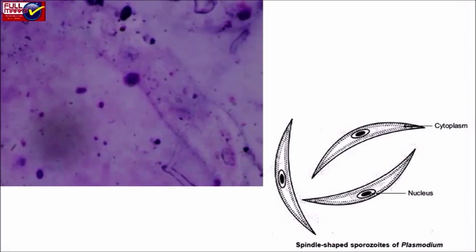Comments: It is a digenetic endoparasite of man. It completes its life cycle in two different hosts: in man as primary host and in female Anopheles mosquito. Its asexual cycle is completed in man while its sexual cycle is completed in female Anopheles. It causes malaria. Mode of infection: Bite of female Anopheles. Sporozoite is the infective stage of Plasmodium for humans, while gametocytes is the infective stage for female Anopheles mosquito.